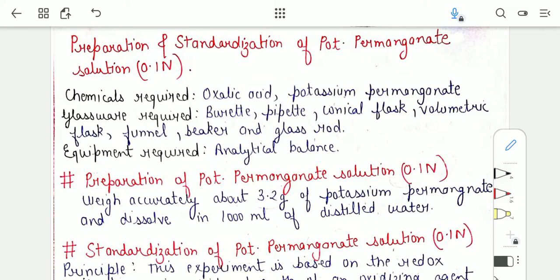Hello everyone. In this video we will talk about the preparation as well as the standardization of potassium permanganate solution of 0.1 normal strength. Okay, so let us firstly talk about the requirements.